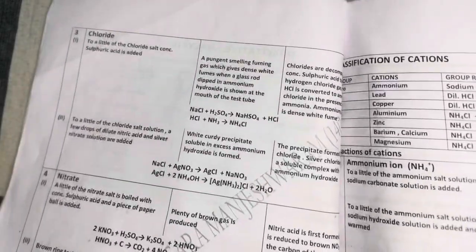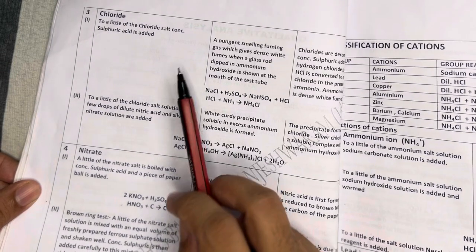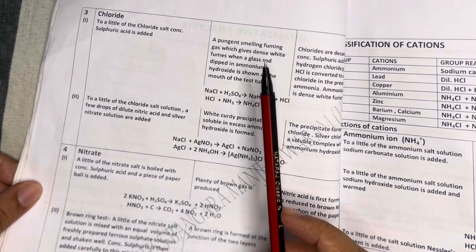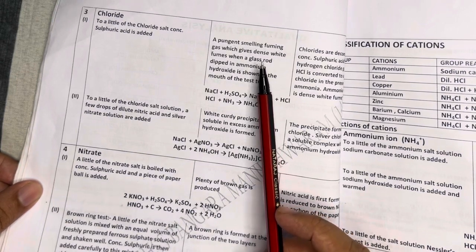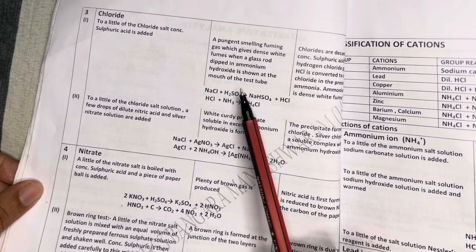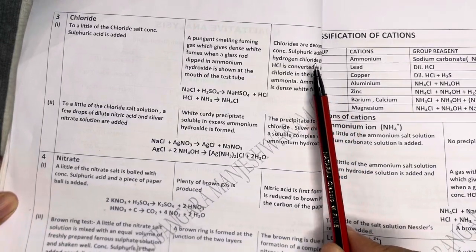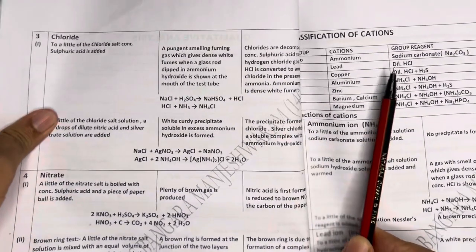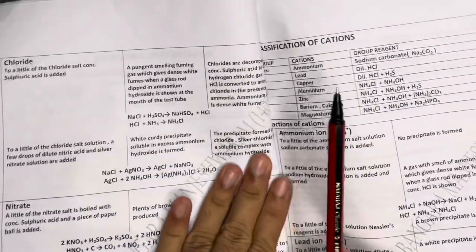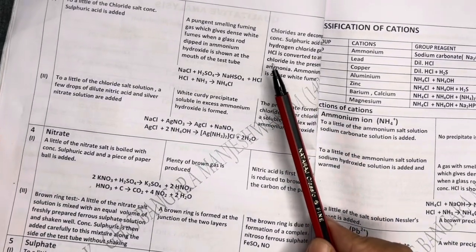Next is the confirmatory test for the chloride. To a little of the chloride salt, concentrated sulfuric acid is added. If you get a pungent fuming gas which gives dense white fumes when a glass rod dipped in ammonium hydroxide is shown at the mouth of the test tube, that indicates the chloride is decomposed by the concentrated sulfuric acid to hydrogen chloride gas, HCl, which is converted to ammonium chloride in the presence of ammonia. So that is the confirmatory test for the chloride.